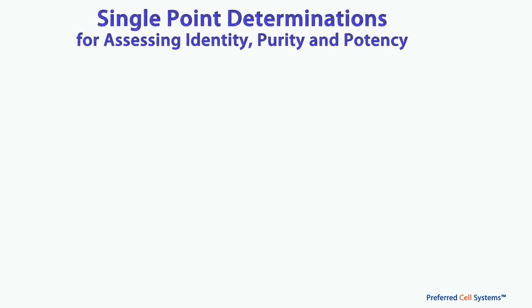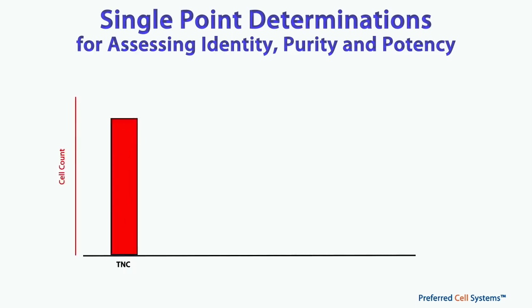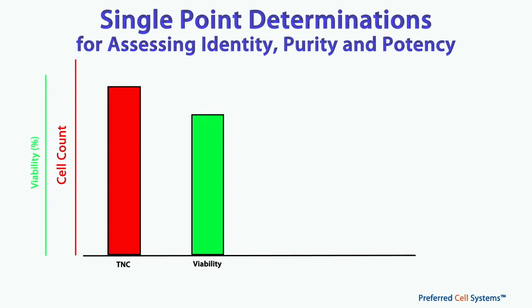Now, the FDA recommends tests to identify the cells and assess their purity. There are 4 primary tests recommended, and they are all measured as single-point determinations. The first is cell count, usually the total nuclear cell count, or TNC. The second is viability. This value is provided as a percentage and should be above 85%.